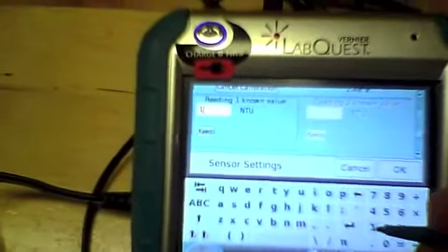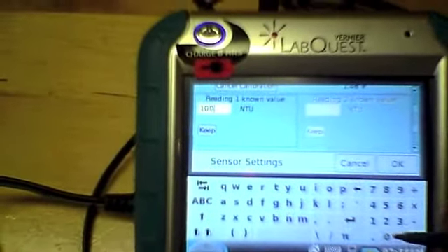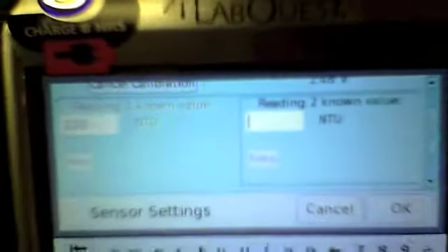And then I want to enter the number 100, and I know the glare is bad. 100 over there. And then this is the part that I had a difficult time with several times. Tough to see here, but you want to click that word keep. If I keep it, then you see the cursor jumps over to the other side of the screen. And this is where I'm going to put my other sample in. So I'm going to take this one out.